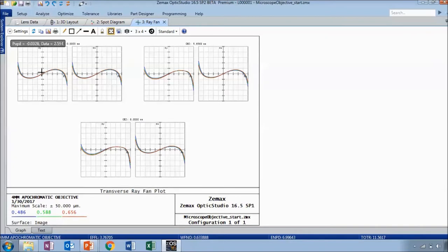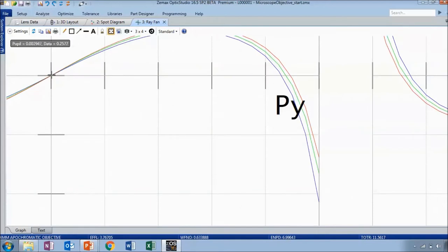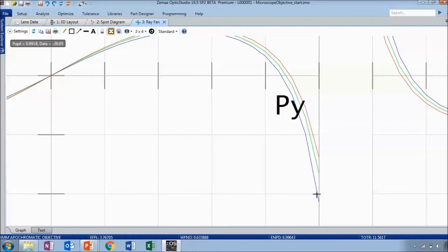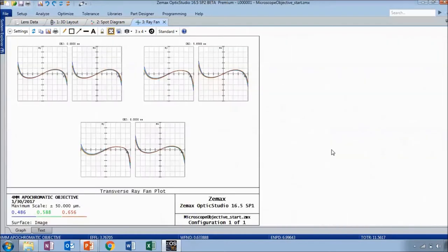You can look at the aberration of the chief ray passing through the center of the pupil versus the marginal ray to look at axial color and lateral color. At this field position, the chief ray for all three wavelengths lies at the same point. But you can see some color separation of the marginal ray, which would cause a wavelength-dependent focus and show up as the traditional chromatic aberration.